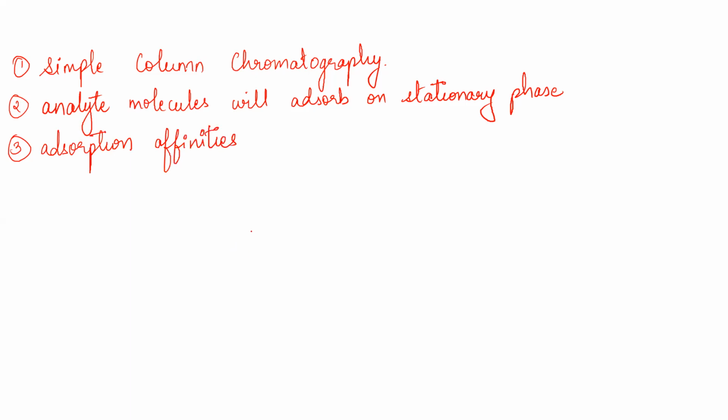If you are loading your sample mixture which has your analyte, this analyte may have more affinity towards the stationary phase, so it will go and attach to the stationary phase. So this is the property that we are going to exploit.